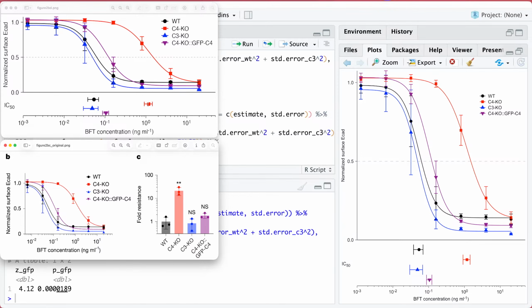The downside, of course, is that it's not as easy to get out the fold change relative to the wild type. And maybe for that, what you could do is off on the right here, you could put the fold change relative to wild type, right? That might actually be helpful. Right here, it's like fold change, and below that have those 3 numbers. And before I post this, I might do that so that you can see what it looks like.